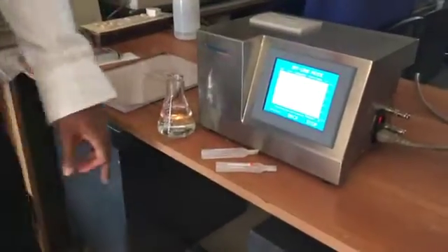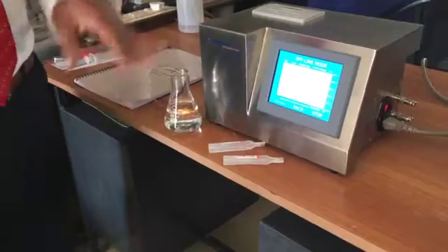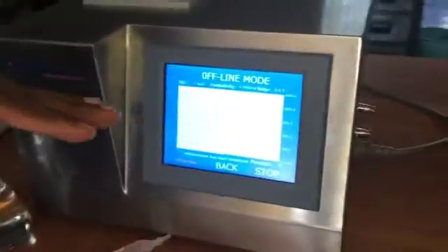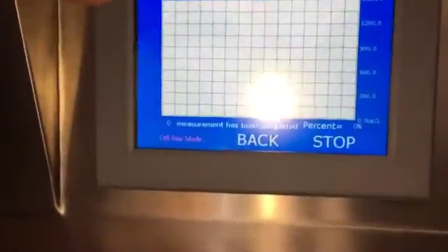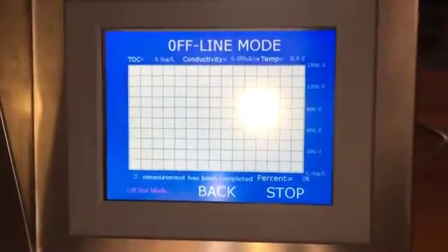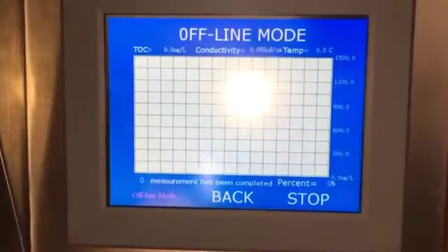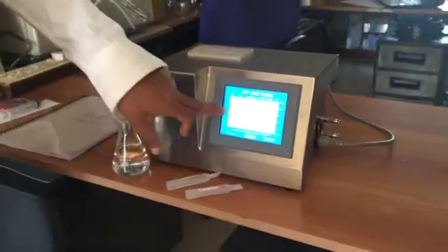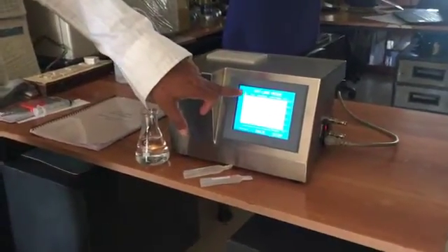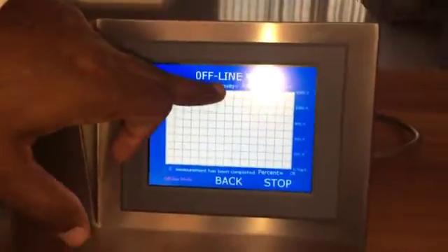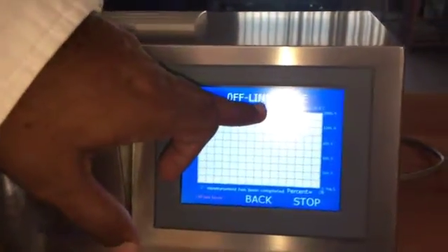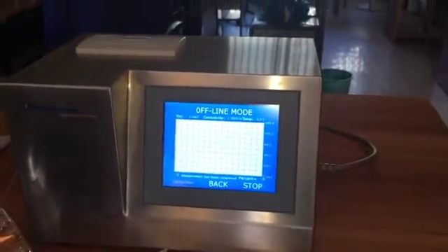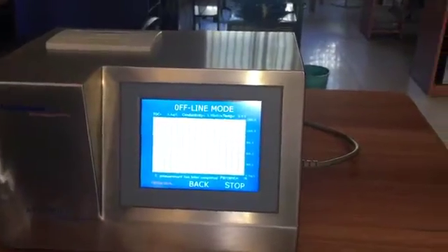In the screen you can see the percentage of progress. It is at 0%, meaning the test is under way. As the measurement progresses, the percentage slowly grows from 0 to 100. Once it reaches 100 you can find the data on the screen — one value is the TOC level in micrograms per liter, another is the conductivity, and the third is the temperature.